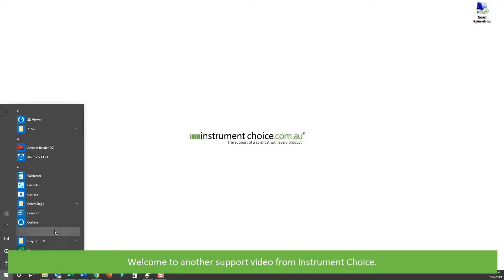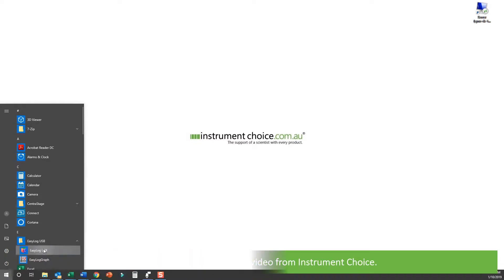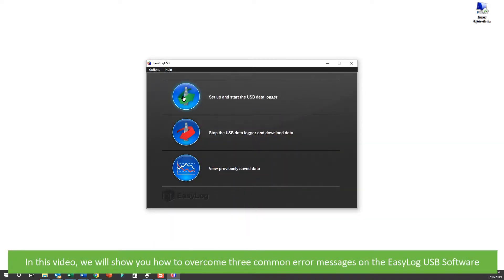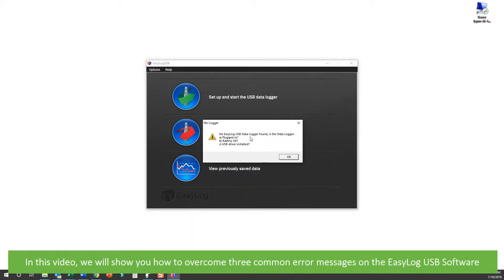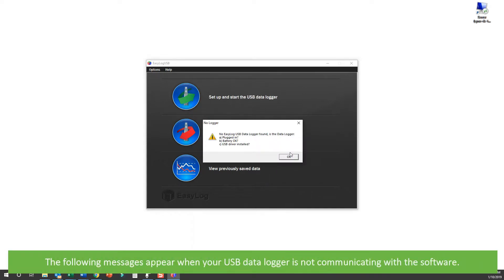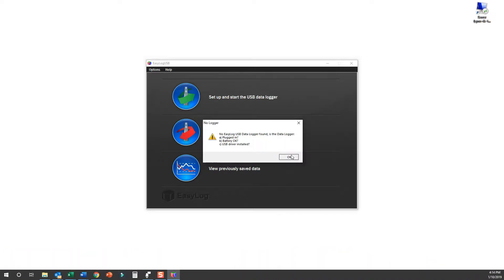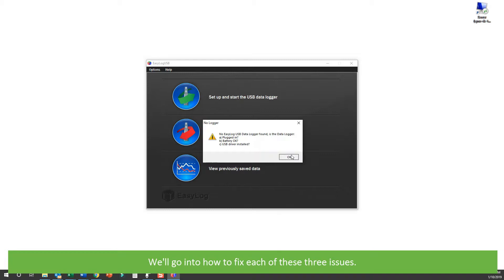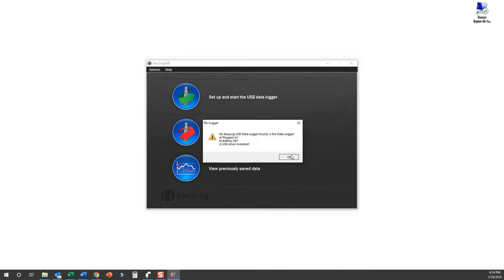Hi and welcome to another support video from Instrument Choice. In this video we will show you how to overcome three common error messages on the EasyLog USB software. The following message may appear when your USB data logger is not communicating properly with the software. These are: if your USB data logger is plugged in, if the battery is okay, or if the USB driver has been installed. Let's go on to each of these three issues and how to fix them.